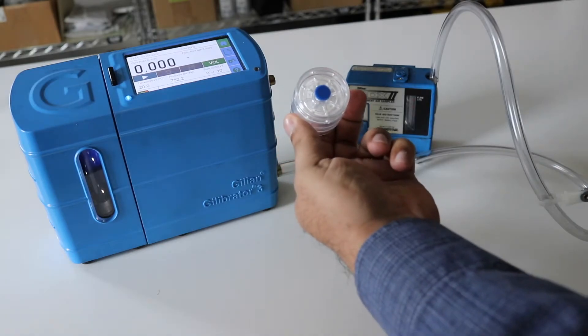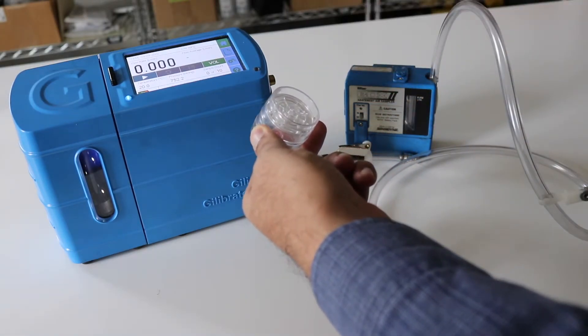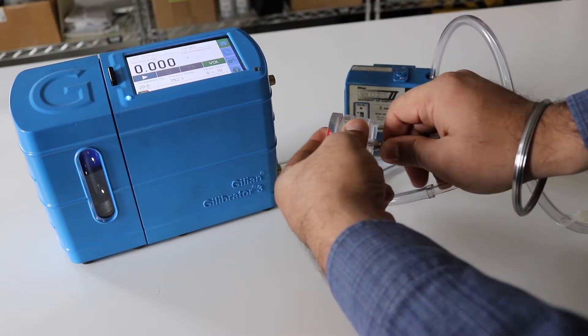Take the cassette and connect the flexible tube of the sampling pump to the outlet side of the cassette. The outlet is always the filter side of the cassette.